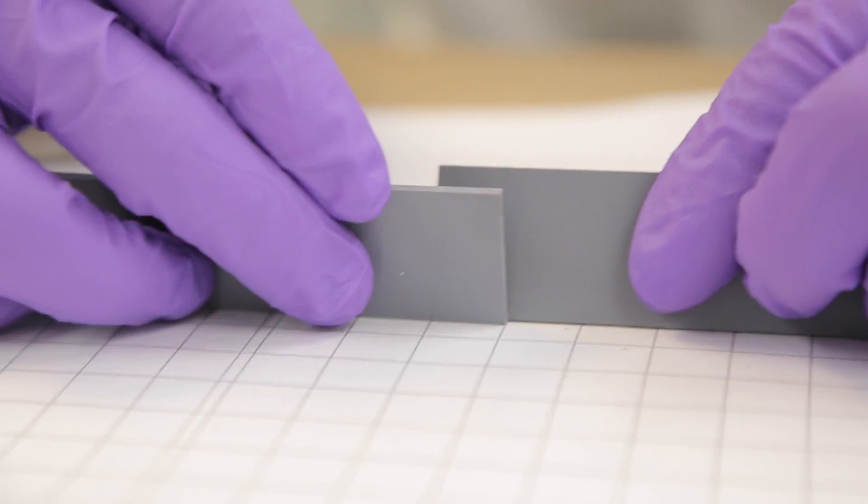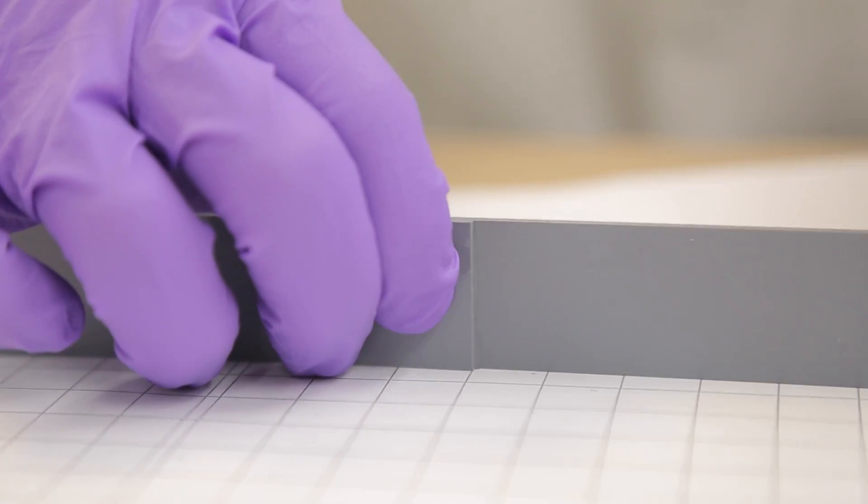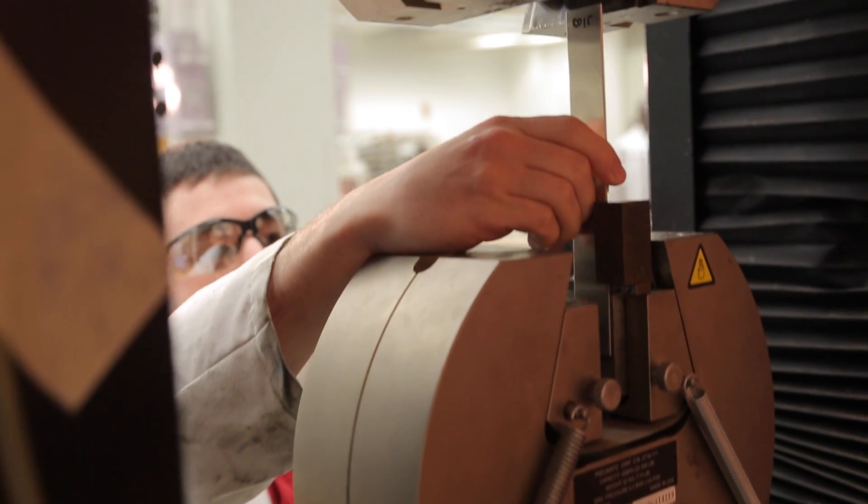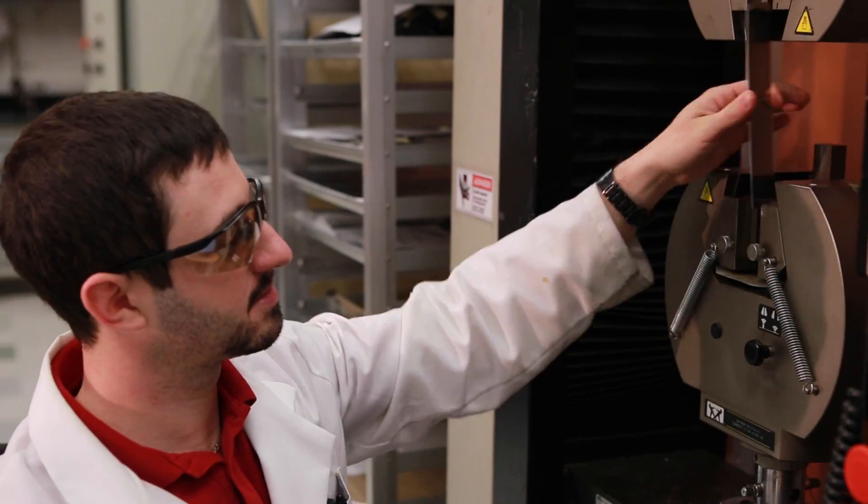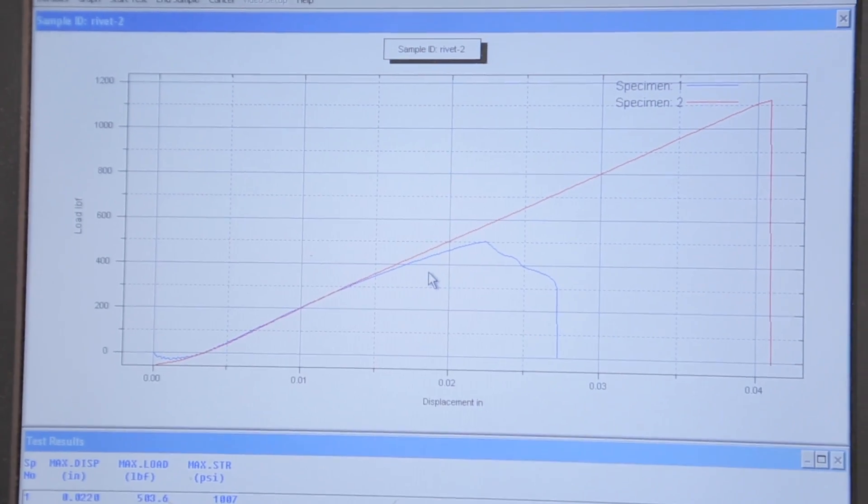One standard method for shear strength testing calls for the bonding of two test specimens overlapped by a specified area. The assembly is secured in a mechanical properties tester and is pulled in shear until failure. We record the load at breakpoint and calculate the corresponding shear stress.